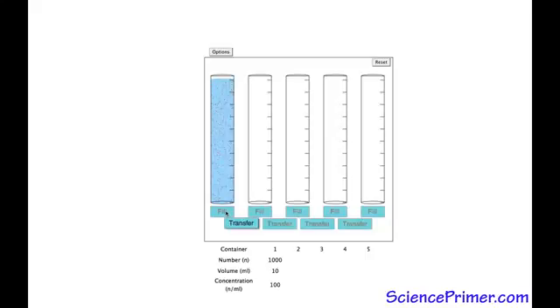So, no matter how well mixed the suspensions are, they remain patchy enough that the dilution series is rarely perfectly uniform. If we start the dilution with 1,000 particles and do the same 10x dilution steps, the first container, when filled with 10 milliliters, has a concentration of 1,000 particles per 10 mLs, or 100 particles per mL. To do a 10x dilution, 1 mL is transferred to the second container. In theory, we'd expect there to be exactly 900 particles in the first container and 100 in the second.